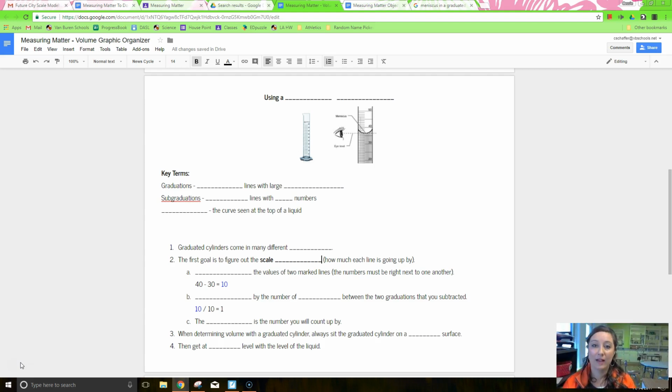We do know that we have a lot of liquid ingredients and we have some powdered ingredients that don't come in perfect blocks. So our next tool that we're going to talk about is probably going to help us a lot with some of those irregular solids in liquids.